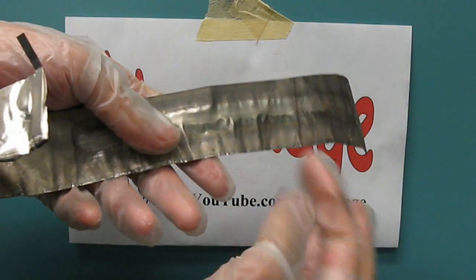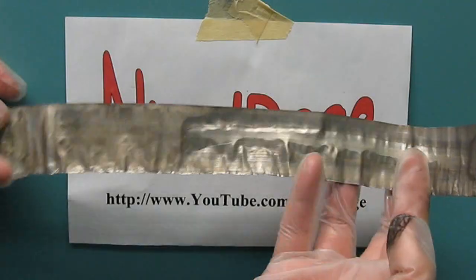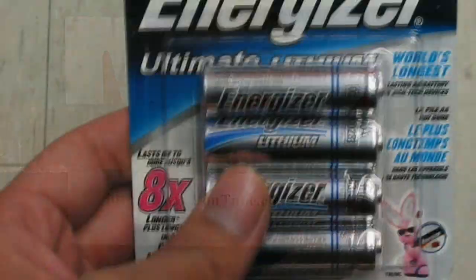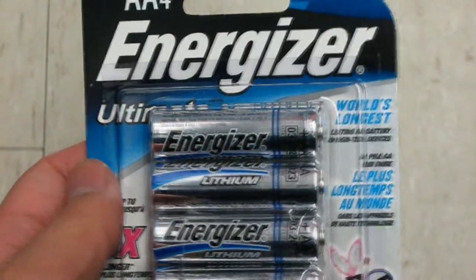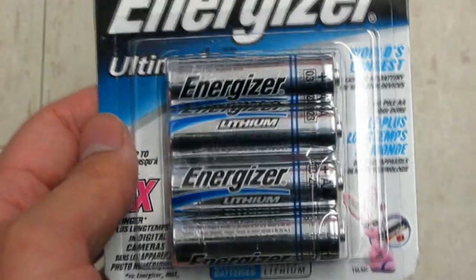Greetings fellow nerds. In this video we're going to get lithium metal. Our source is these Energizer Ultimate Lithium batteries. Regular batteries do not have lithium and cannot be used.